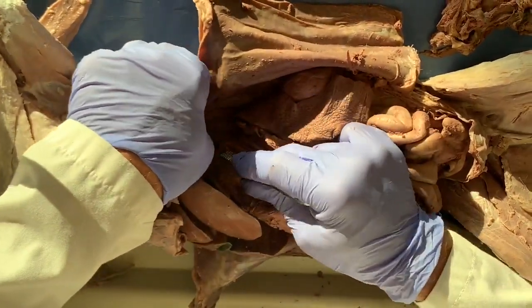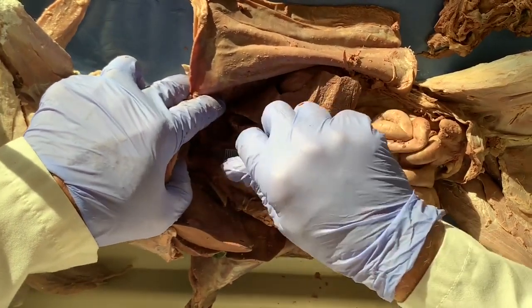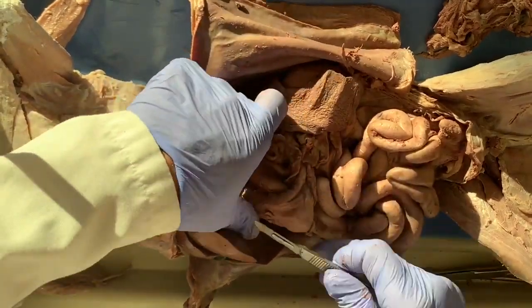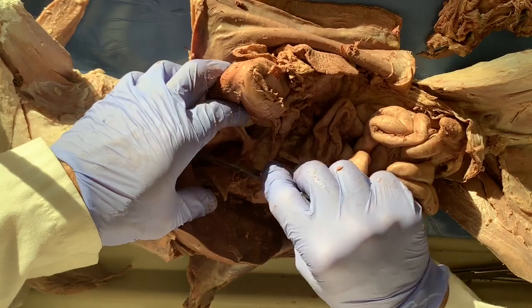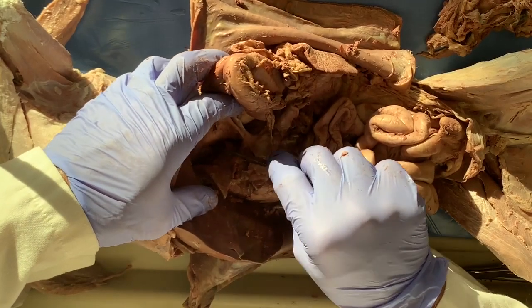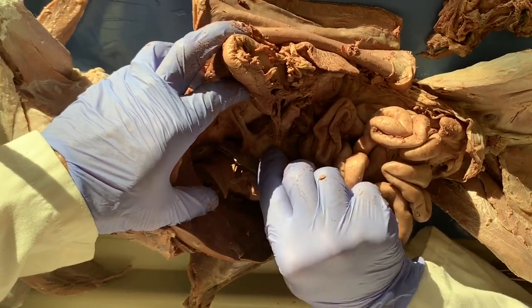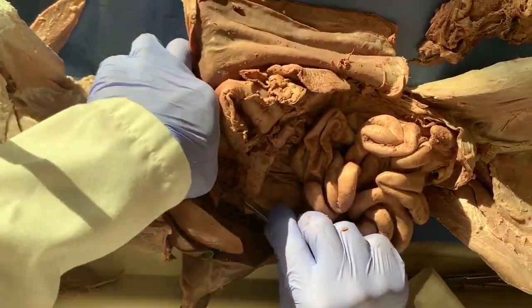I'm going to make these incisions into the diaphragm wall and break the connective tissue that's binding it until I can see the esophagus, which has this kind of white tube appearance to it.